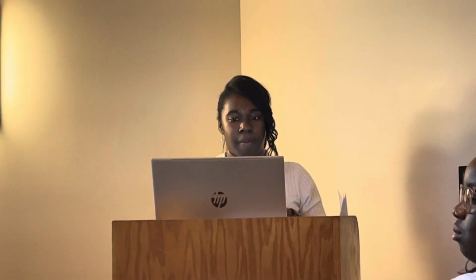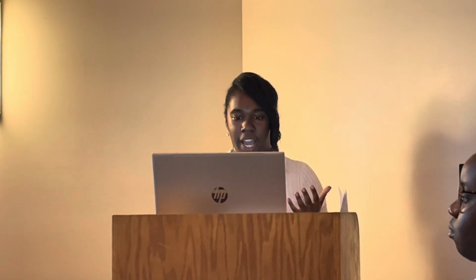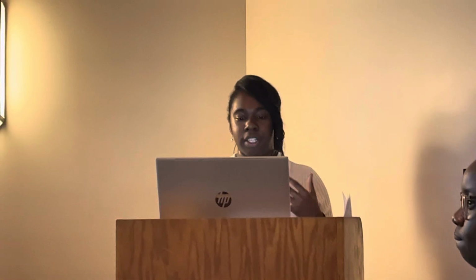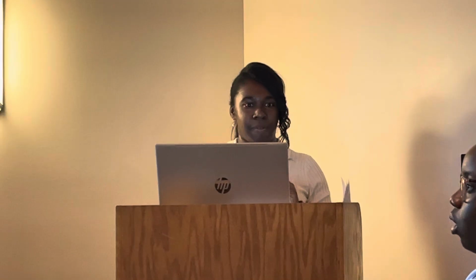And so my project this summer, I worked, of course, under Dr. Reimer. And my project this summer was tuning the activity of nanoporous zeolite from hierarchical designs to bifunctional catalysts. So to start off, you all are probably thinking, what even is a zeolite, okay? What is a zeolite? That's the first thing we're gonna go over. The second thing that we're gonna go over is what did I do? And the third, of course, is final remarks, thank yous, and conclusion.